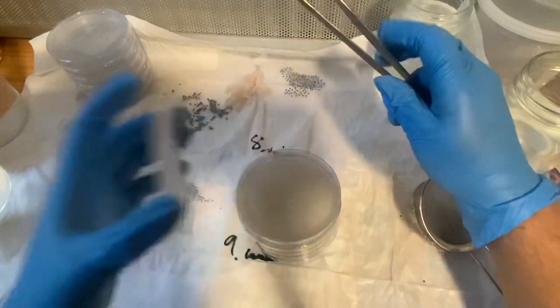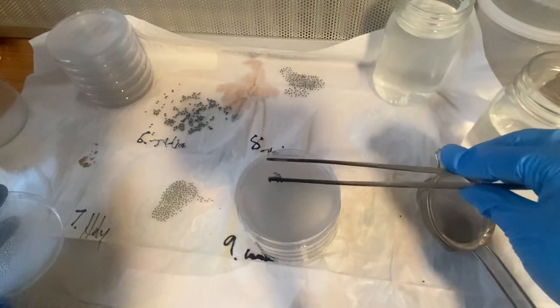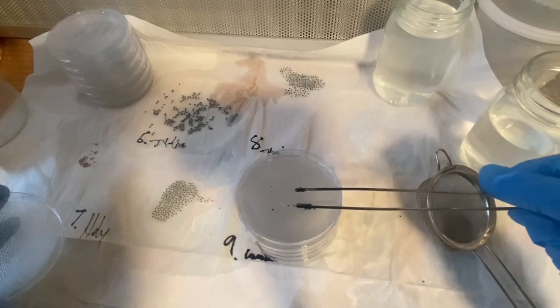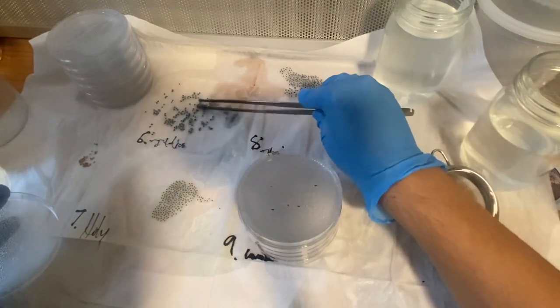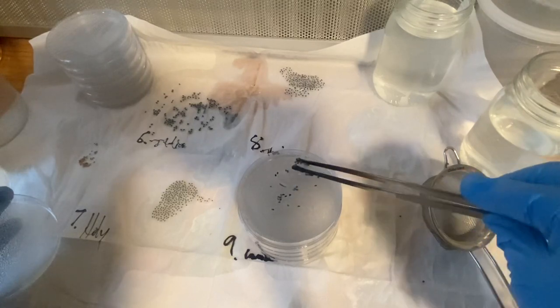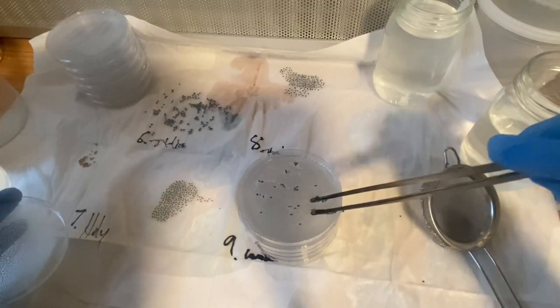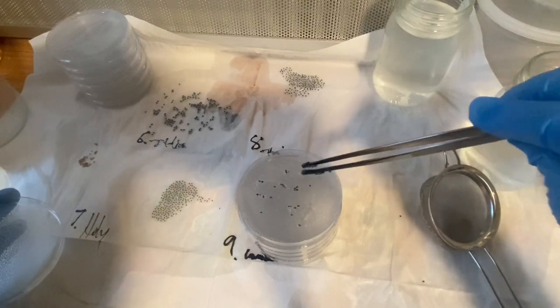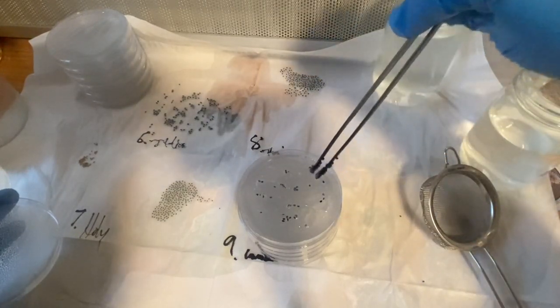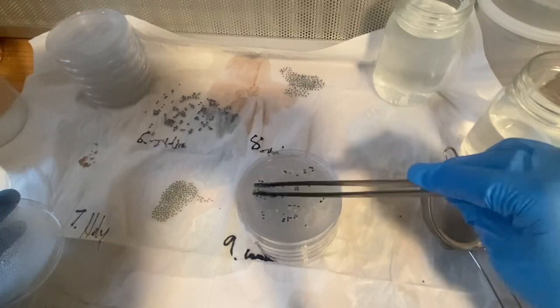All right, let's start with this Italian basil. They were going to come off a little bit easier, so let me scoop a lot. Okay. It's okay if they're close to each other. We just don't want them to be too close in case there's contamination. We can go back in here and pull out the seeds that we need to. Alright, we just want to make sure that they are getting contact with the media. It's okay to even kind of mash it up.